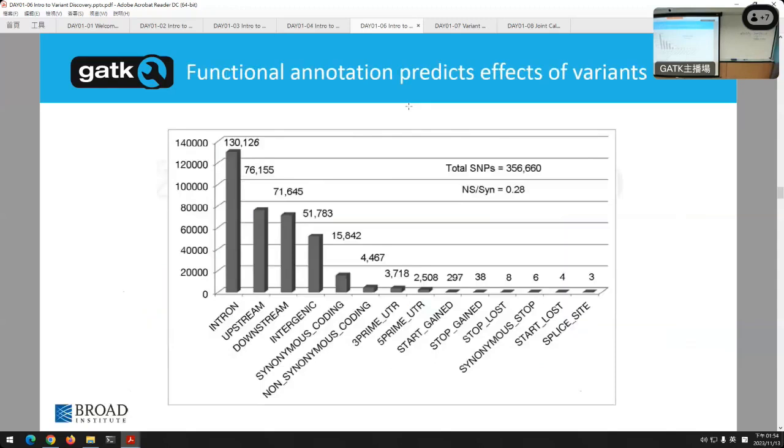And then lastly, it's very important to annotate all of your mutations with how much of an effect they have biologically or could have biologically on your patient. So just at a high level, sometimes you have an insertion or a deletion. Let's say a deletion of one base. If it's randomly in the genome, it probably doesn't do anything. But if that one base is a deletion of one base in an exon, remember the way it works with exons, you have these codons. Every three bases in an exon gets translated into a protein.